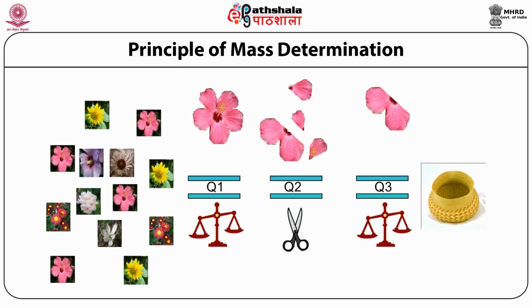When it hits the detector, this combination gives us the third degree of confirmation for a molecule. First, you semi-purify the compound before injecting it into the HPLC or gas chromatography. Once the molecule has been injected, it comes into the ionizer. The ionizer ionizes it into its ionic state, where it is charged. The charged molecule, by using RF (radio frequency) and DC voltage, is allowed to resonate at a particular value, thereby separating it in quadrupole 1.